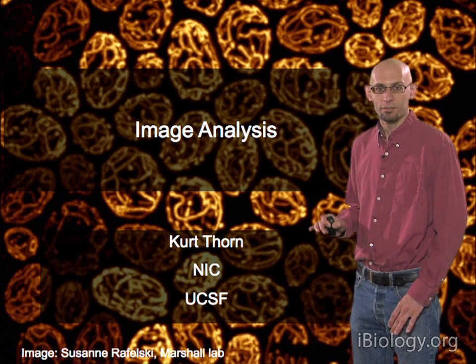So the idea is we take the first corner of this image, drop that smoothing matrix on, and then multiply and average those guys. And that gives us a value here. Do it one over for the next value, and so on and so forth. And if we do it for the whole image, we get this, and that looks like this. And so you can see we've averaged out and blurred these structures here. One thing, if you were looking at this closely, you may wonder about is how do you deal with these edges, right?